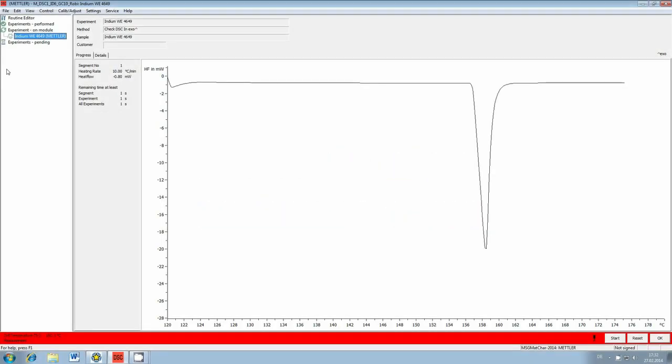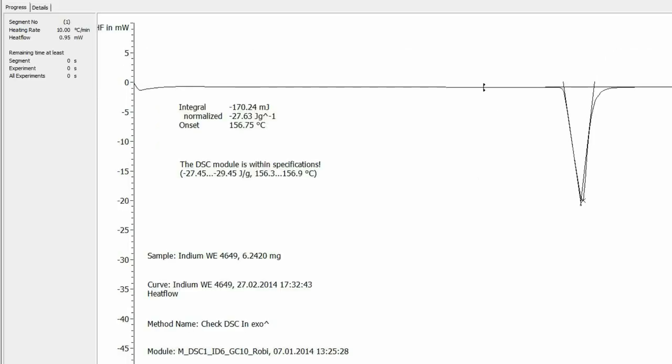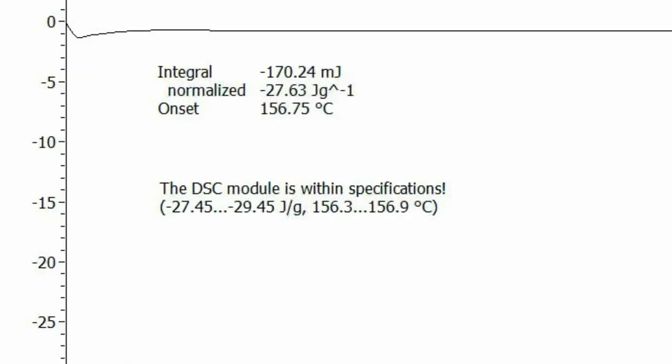After the measurement is completed, the curve is automatically evaluated and the result displayed inside the module window. The curve is also validated regarding onset of sample temperature and enthalpy of fusion.